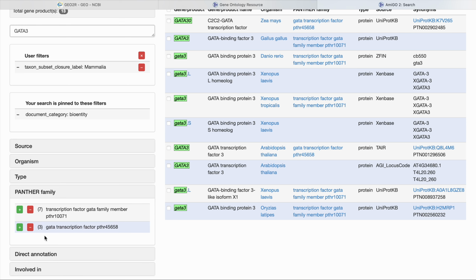Okay, so here in the Panther family classification you have two types of filters. What is this particular classification? Panther family classification is a type of classification. In protein also we have multiple different ways of classifying things, like PFAM is a technique for family-based classification.